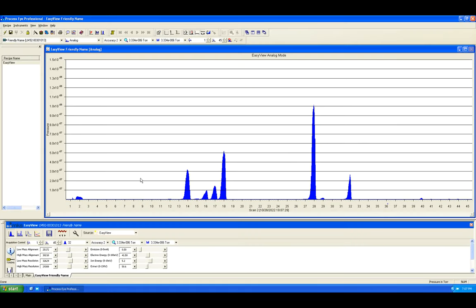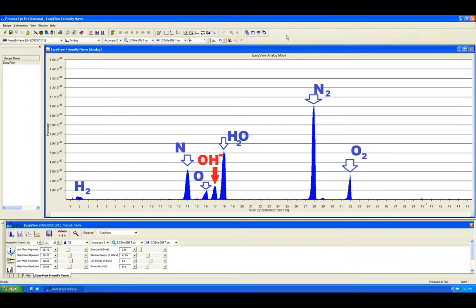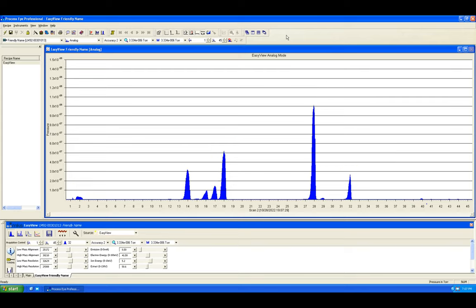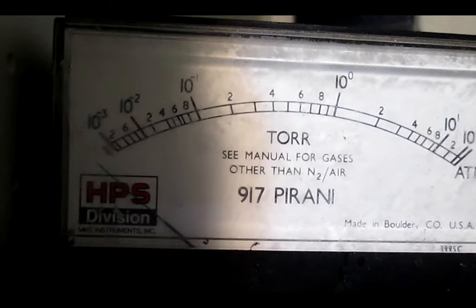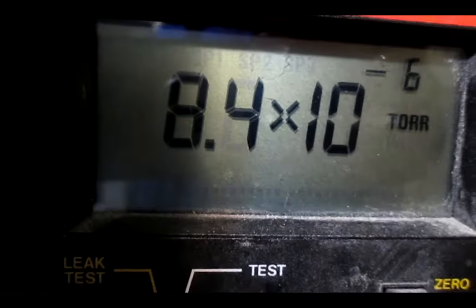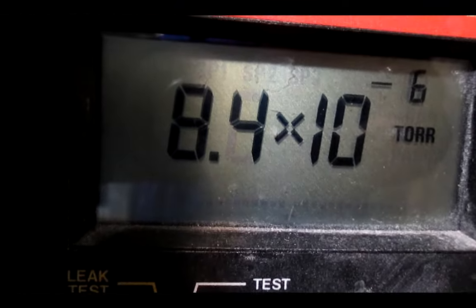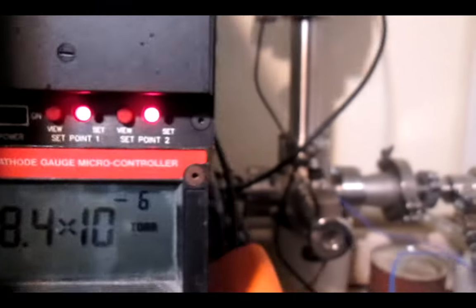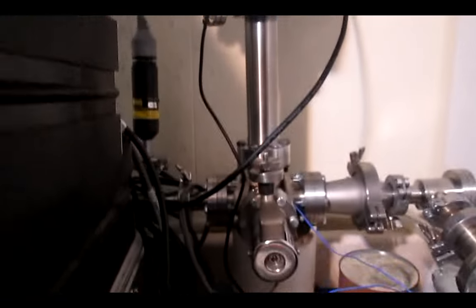an argon atom can collect two charges instead of one and masquerade itself as a lighter mass 20 instead of the actual weight of 40. Monitoring these doubly charged species and tuning the system accordingly helps reduce these types of interference.